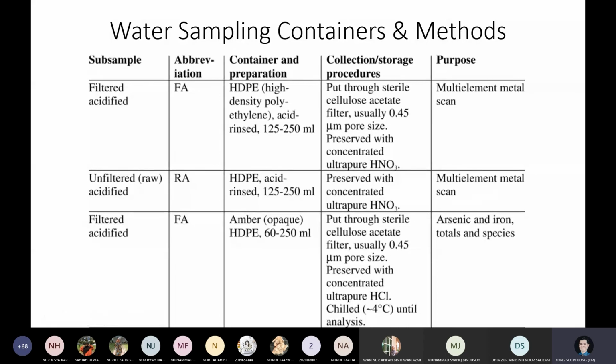So no worries lah. Just don't use your mineral water bottle to collect water samples. That's all. Because it's HDPE, they are very dense, they are very durable, and they can last with high temperature. And one more thing, they can be reused. You can bring it back, wash, and reuse it. But once again lah, what do you want to use as usual?